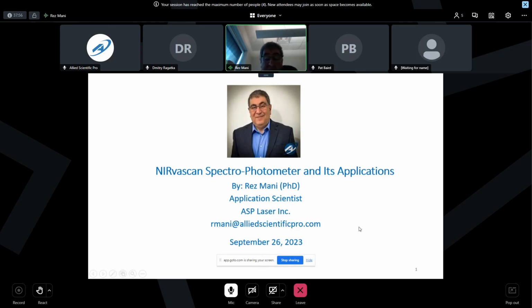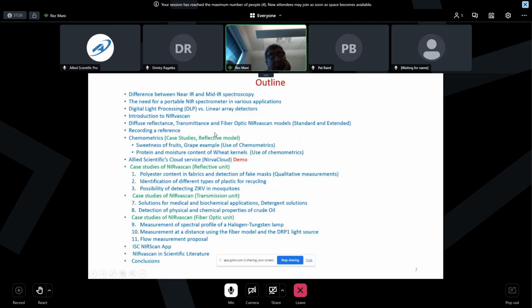I know some of you have already purchased the Nirvascan instrument. Some of you have purchased it but are waiting to receive it, and some others are contemplating purchasing it. So I'm trying to give you as much useful information as possible about the instrument and also about the cloud service, so you know what to do when you receive the instrument, or if you already have it, how to use the cloud.